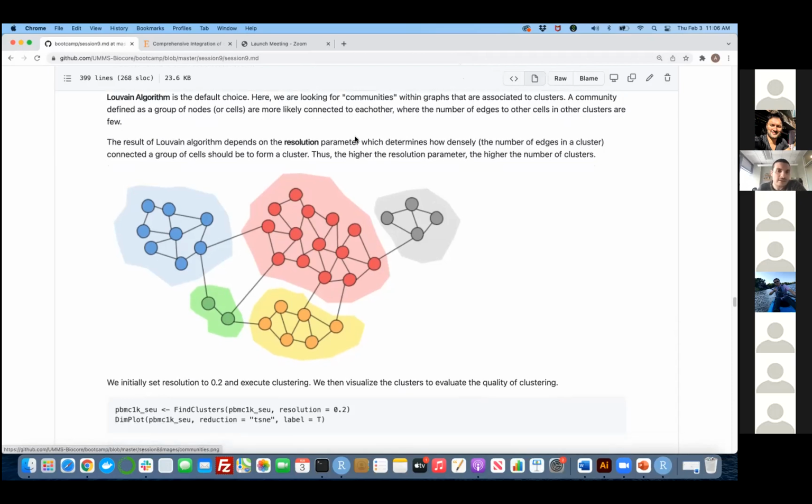But the interesting thing is, how do we determine this threshold of having a lot of lines between these cells, right? We have to have some kind of a parameter or threshold to determine what is the optimum amount of lines that you have in a group of cells in order to consider them a cell group. That may depend on the situation, and that gives us flexibility to play with our data a little bit and pick apart cell types.